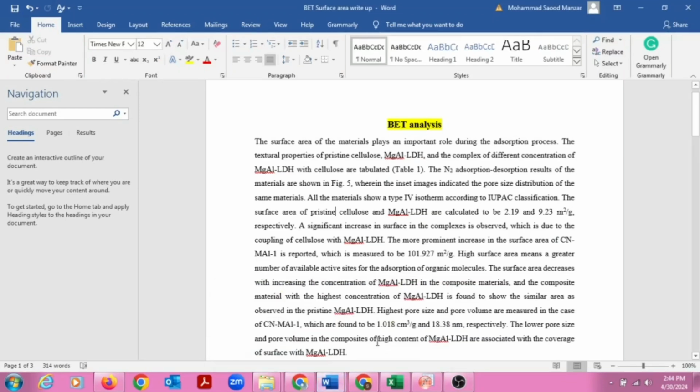Surface area data is also called the BET, which is commonly used to evaluate gas adsorption data and generate a specific surface area, expressed in the form of area per mass of sample, that is meter square per gram. So 1 gram of the adsorbent, of the prepared nanomaterial, will occupy how much area. This is also sometimes called specific surface area or BET surface area.